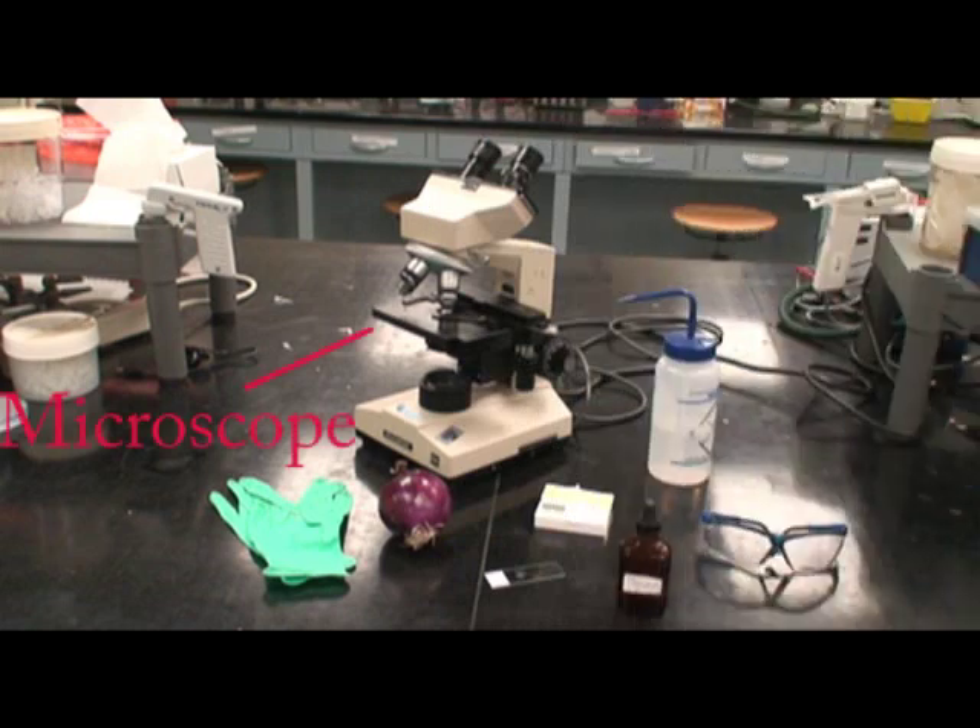For this lab, you will need a microscope, water, an onion, a cover slip, a slide, 0.5 molar or plasmolysis solution, goggles, and gloves.